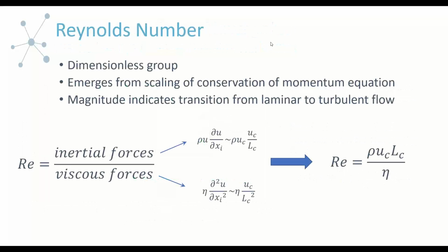Okay, so now moving on to some of the parameters that you might want to look at to guide you in how to interpret what could be happening in your flow channel and what this might mean for the data. Dimensionless groups are quite common. They're quite valuable in rheology and, I would say, fluid mechanics in general, because they look at the relative magnitude of two contributions that can be occurring at the same time. The different numbers are defined by the relative contributions that you're trying to gauge.